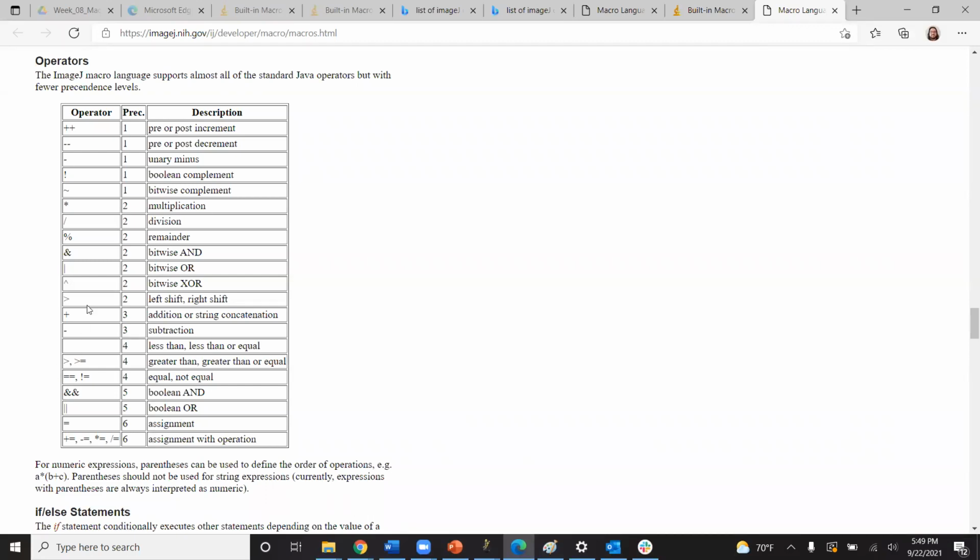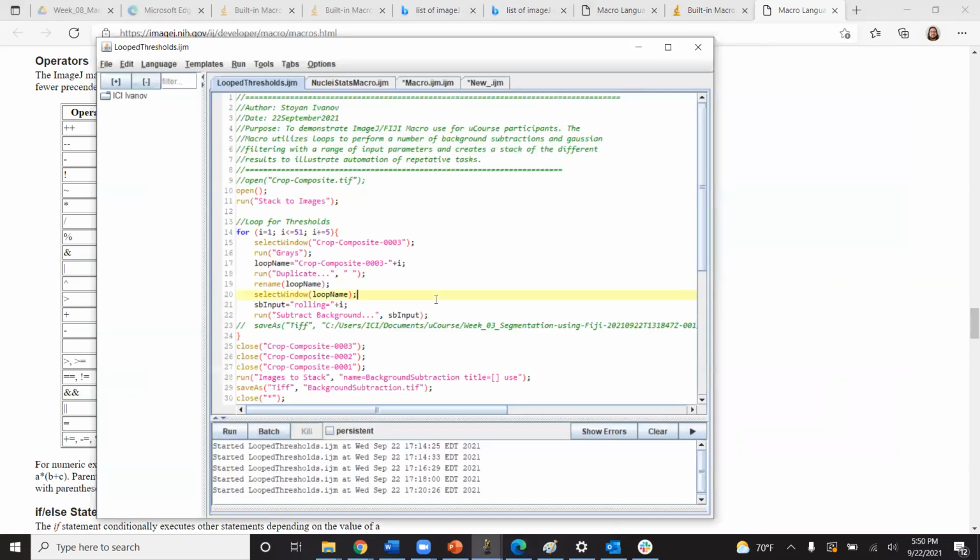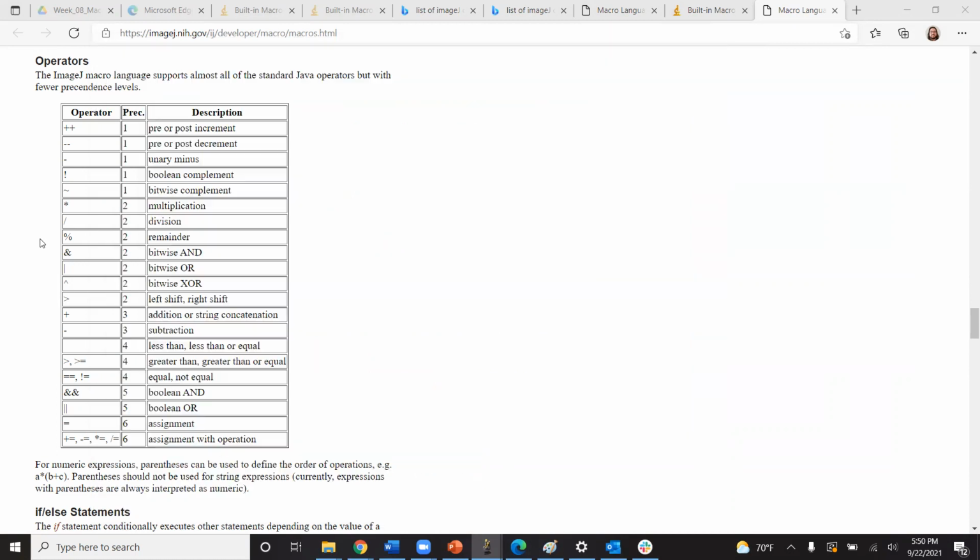That's one of the ones that you'll see used more often, usually in instances where you're inside a while loop, for example, or a for loop where you want to keep a running counter of how many iterations you've had in cases where your index is maybe not linear. But yeah, these operators, pretty good to know. They're a pretty good reference.